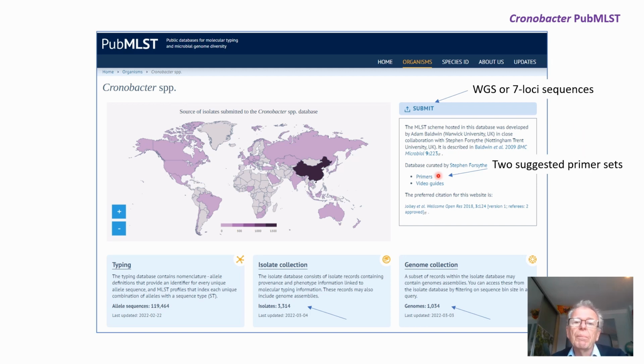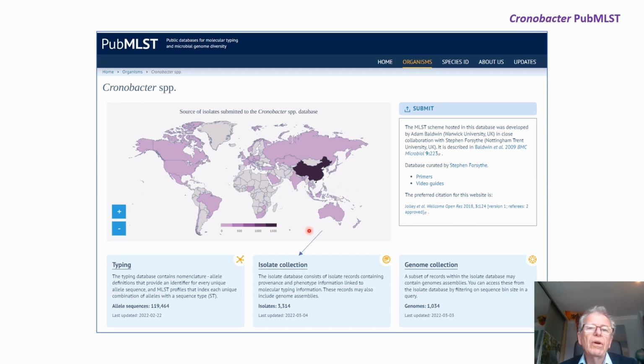If you want to look at the primers, they're here, and bear in mind that there are 2 suggested primer sets now. And if you want to look at video guides like this one and related ones, then just click here. At the time of making this video, there were over 3,000 isolates in the database and over 1,000 genomes. We're initially just going to click here with regard to the isolate collection.